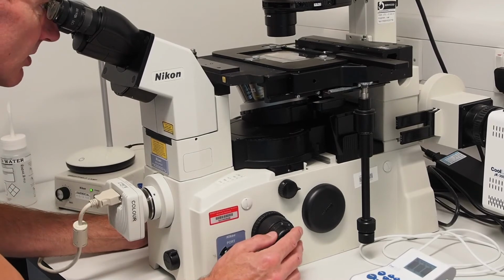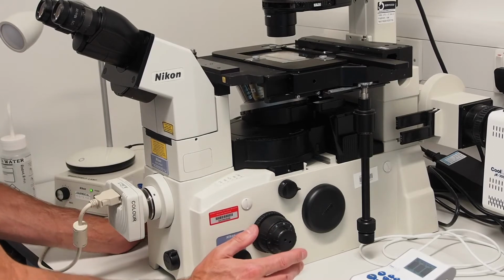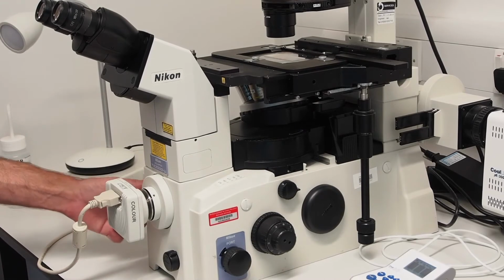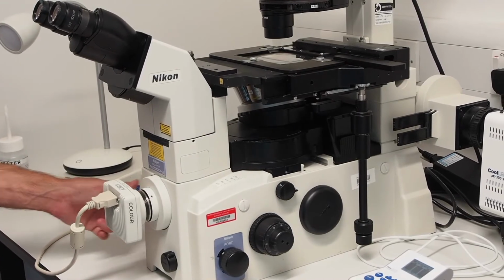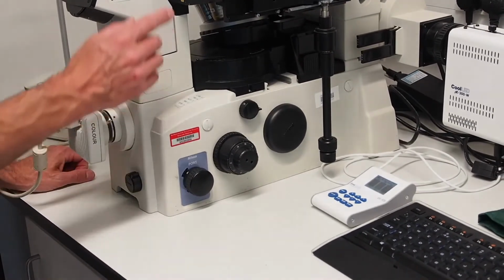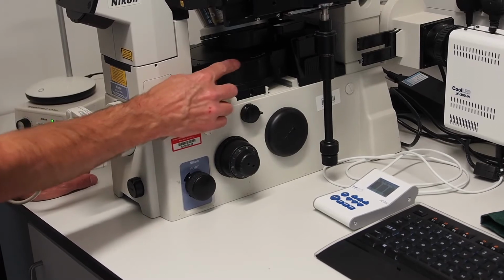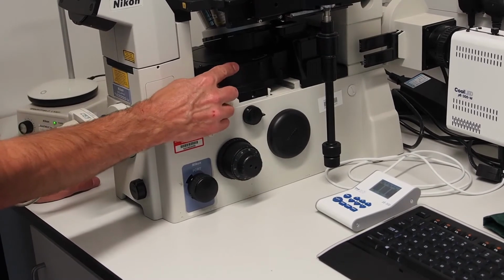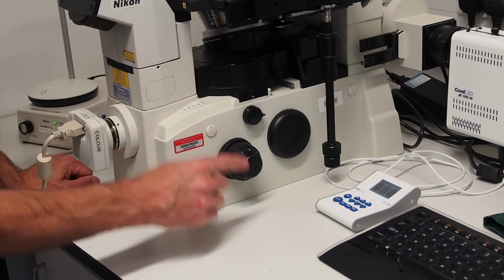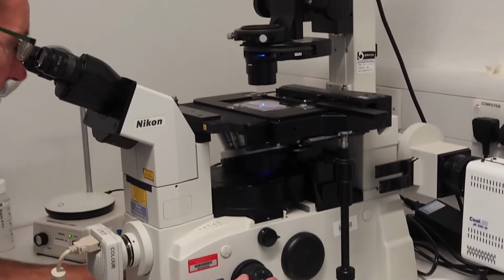If you are happy with focus and want to see the fluorescence on your sample, turn off the transmitted lamp, rotate the manual filter cube from the empty position 4 to either the blue DAPI, green FITC, red TRITC or far red Cy5 filter cubes and turn the fluorescence lamp on using the control pad. You should now be able to see your sample fluorescence down the eyepieces and adjust focus as necessary or change filter cubes to see other fluorophores.